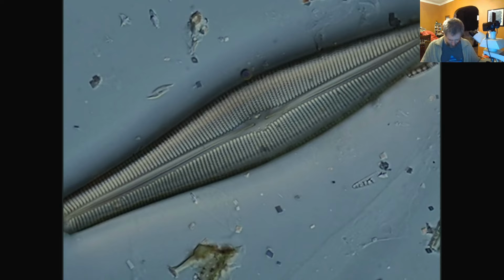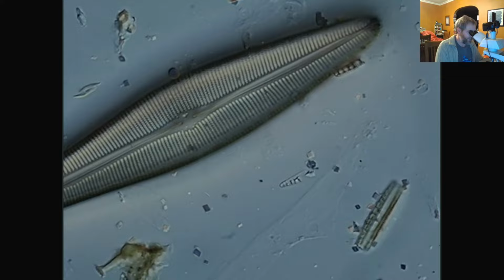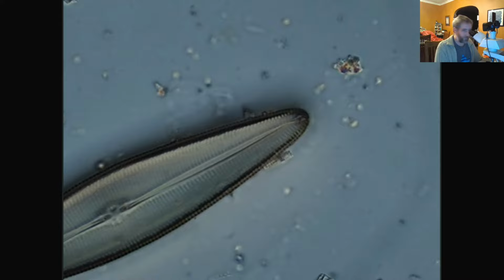Anyway, so that other gomphonemoid that we looked at didn't have those long lateral lines going along the axial lines, and belonged to a different group. But all of the gomphonemas, gomphonemes, have something called a pseudoseptum. So when we look at the focal height where the surface is in focus, we can see the striae really well.